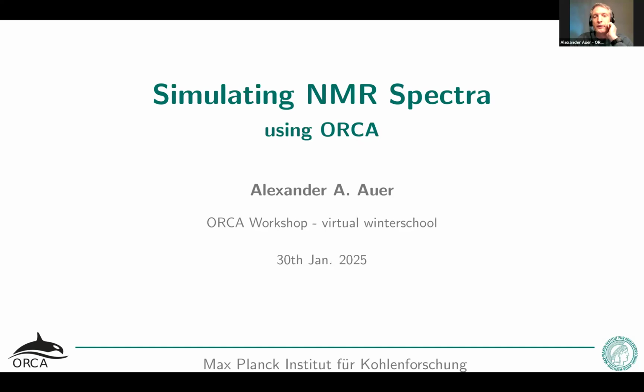I will tell you something about the capabilities to calculate NMR parameters and simulate NMR spectra.